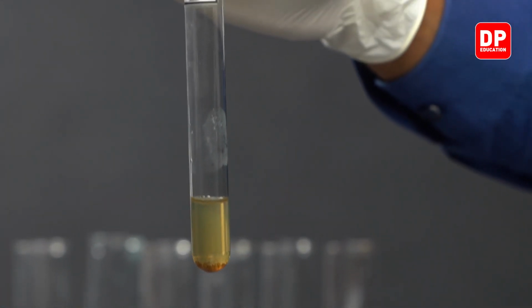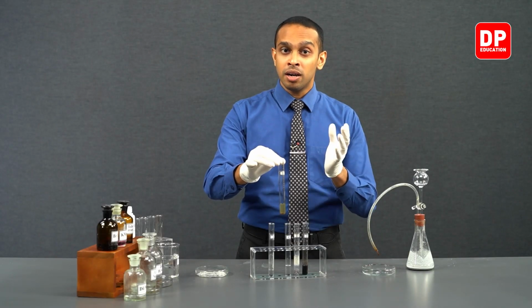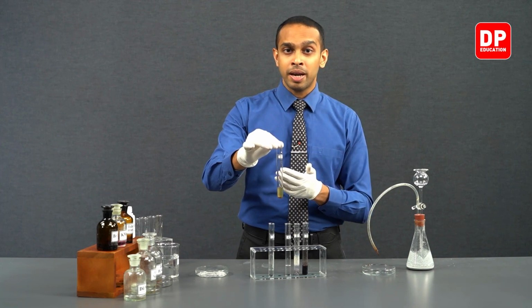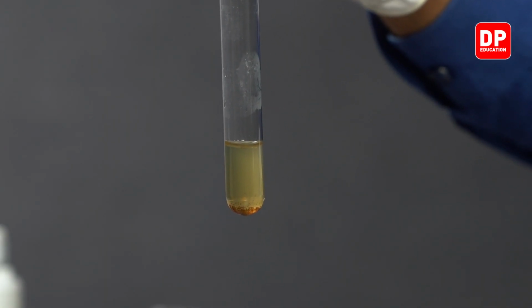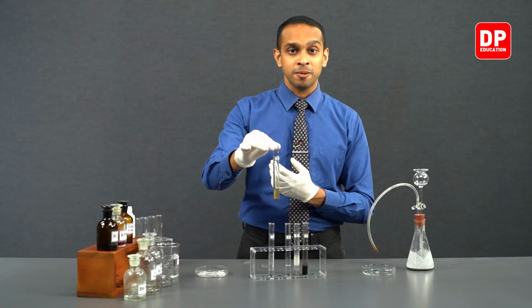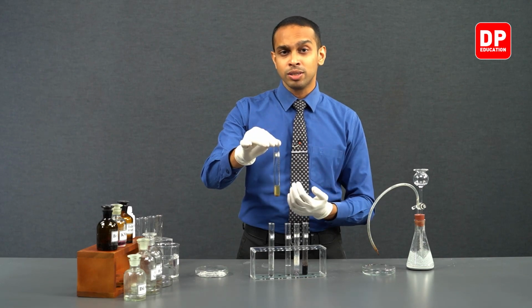Actually, it is first, the purple color first changed to a green color, right? This is due to potassium permanganate, which is a purple color solution, forming a potassium manganate solution, which is a green color solution. And these manganate ions are going to get further reduced to form manganese dioxide, which is a brown color precipitate.